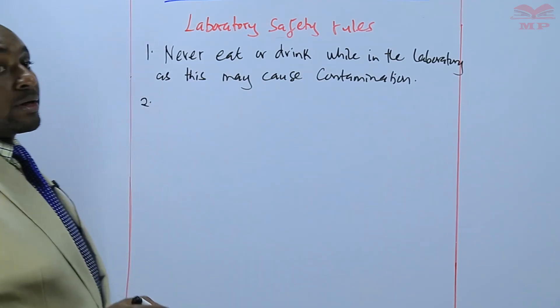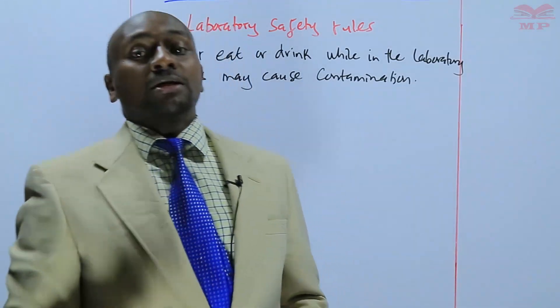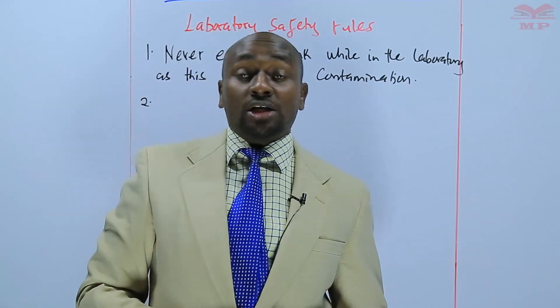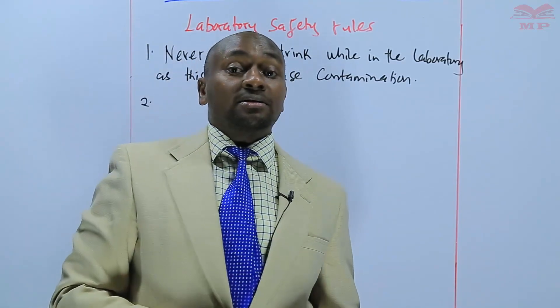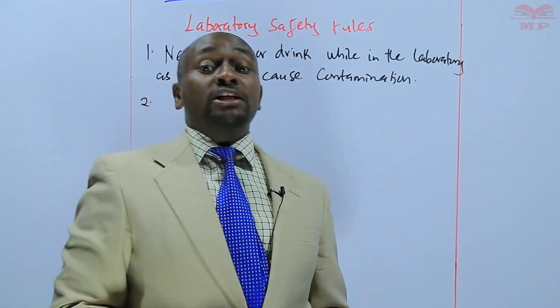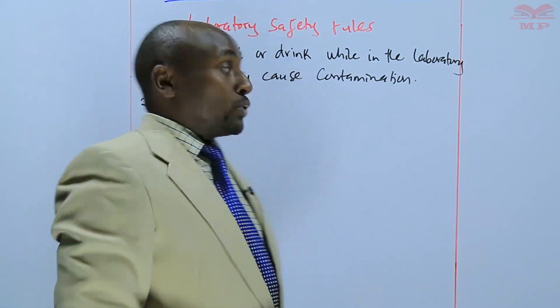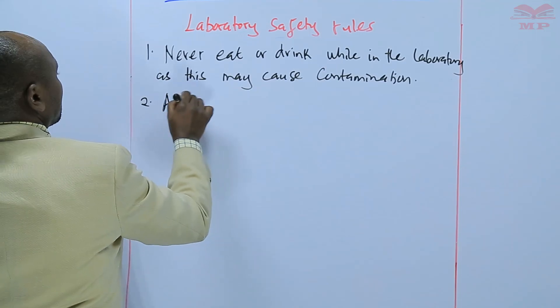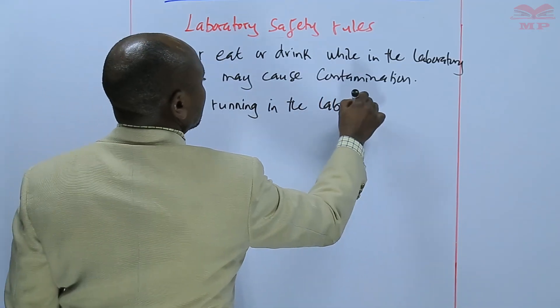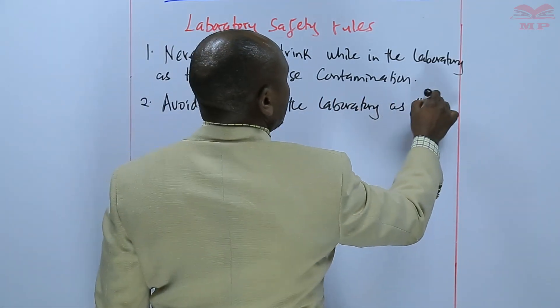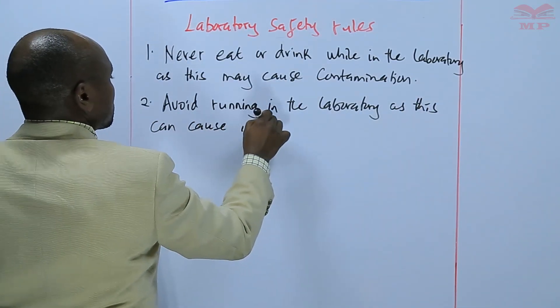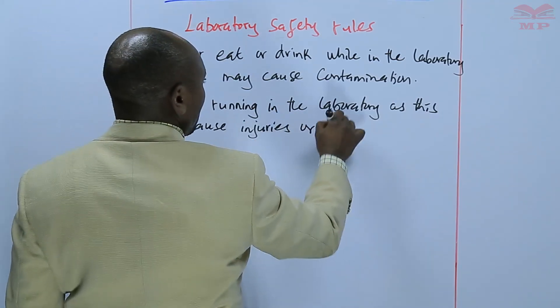Safety rule number two: never run around in the laboratory, because when you run around you can easily fall and injure yourself, or you can easily break the apparatus. Remember, most of them are made of glass. You should also avoid injuring the person next to you, so avoid running in the laboratory as this can cause injuries or breakage.